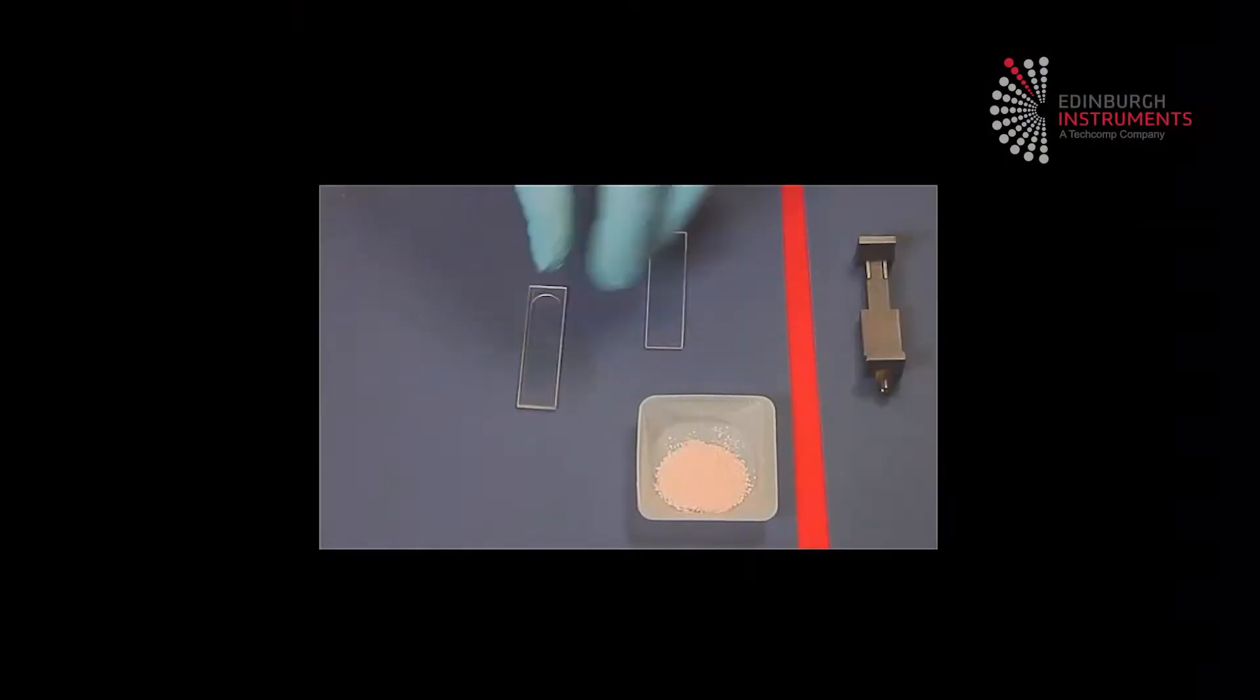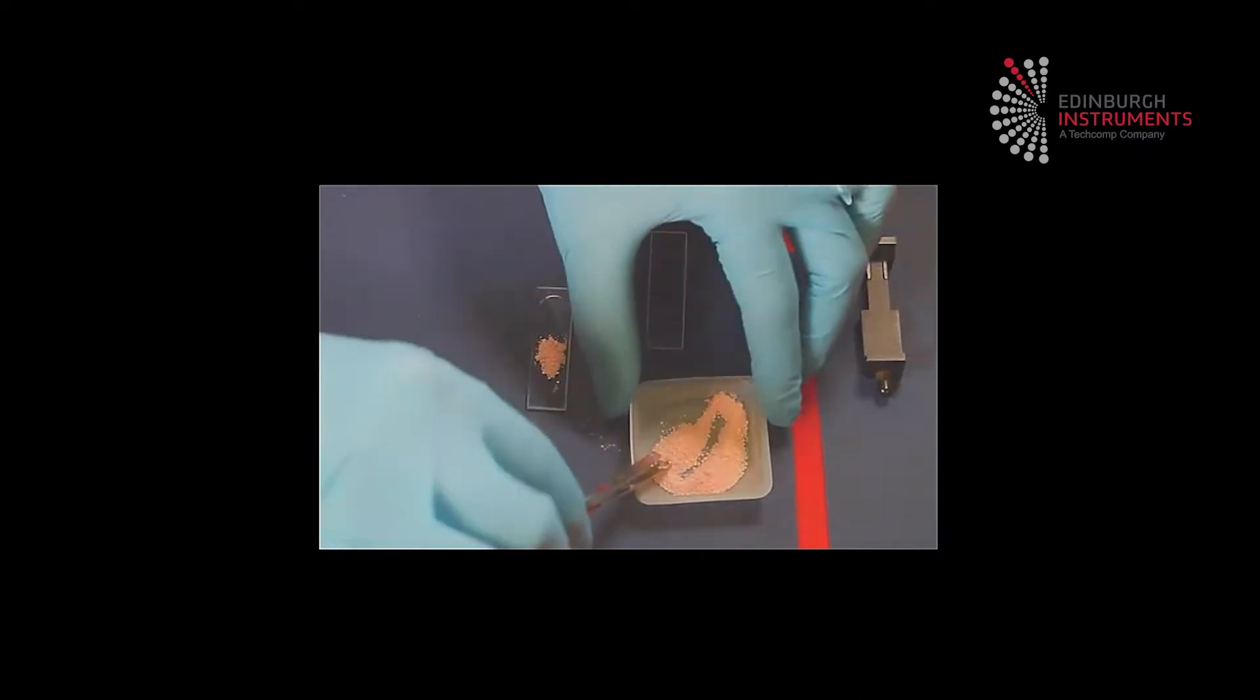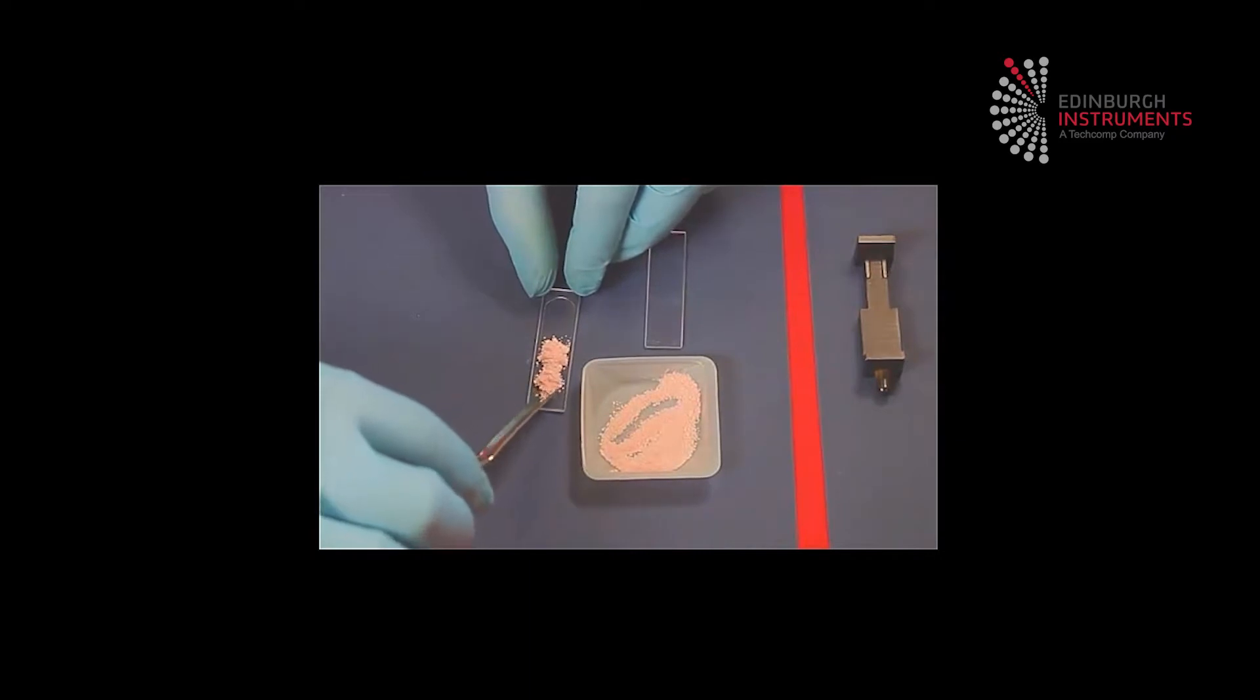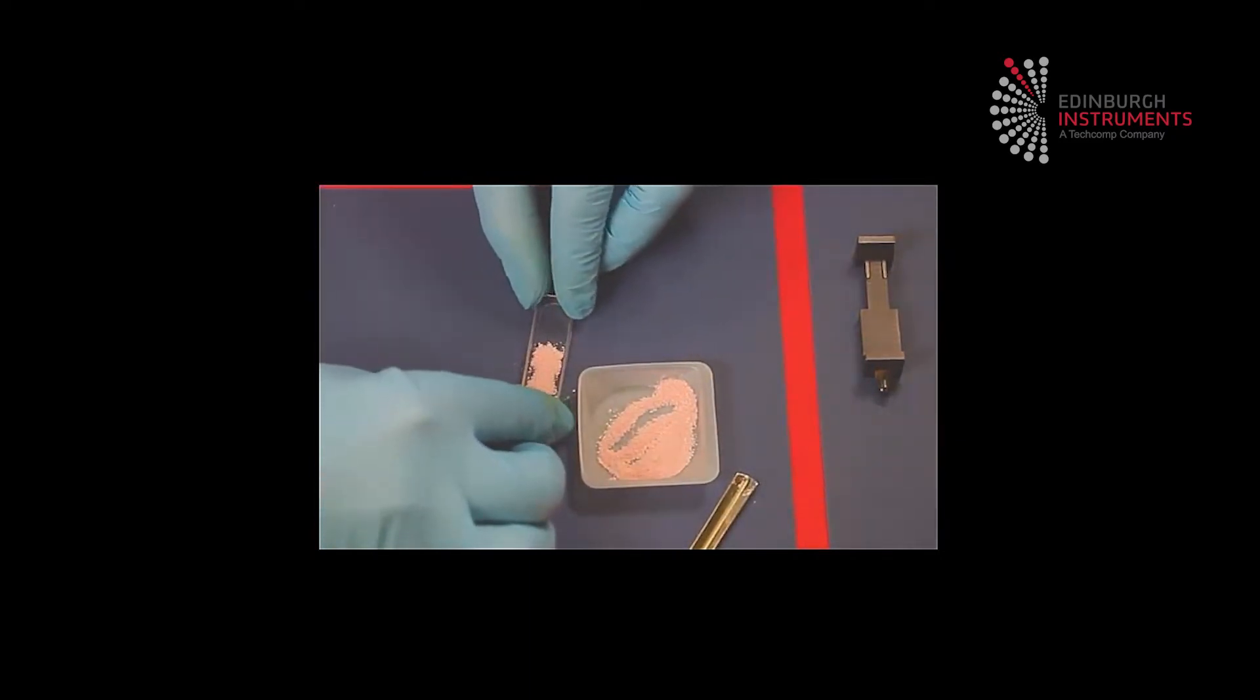Powder samples can be mounted in the demountable cuvette. Solid samples come in many sizes and shapes, so some creativity is often needed. Film samples can be mounted on the small jaw clip.